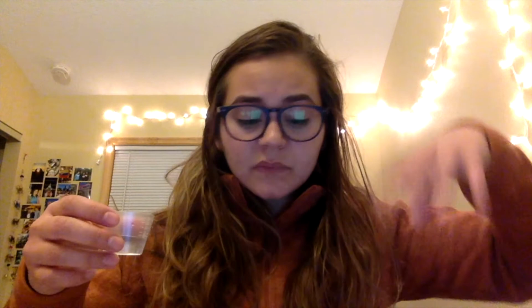So now we're going to take our saline solution and we're going to sip it. Don't drink it, just hold it in your mouth and swish the solution around your mouth for 30 seconds.